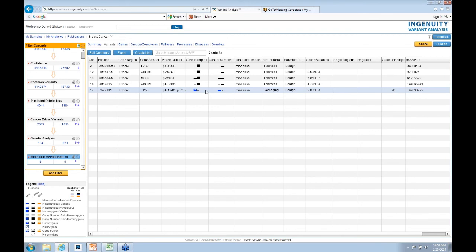So it's really up to you what you're interested in looking at and analyzing, and there should be enough flexibility in that filter to do either one. I would usually do them separate. Again, just me being me, I like to keep it simple. I would say, well, what's unique to my tumor? What genetic burden did my samples already have before they even became tumorigenic? So hopefully that answered that question.